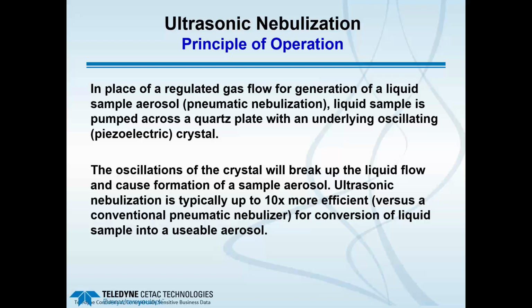We're simply going to use that gas flow to carry the aerosol that's generated by a different process, in this case, the oscillating piezoelectric crystal. Those oscillations will break up the liquid flow and cause the formation of a sample aerosol. This type of nebulization is typically up to about 10 times more efficient versus a conventional gas-based or pneumatic nebulizer for conversion of the liquid sample into a usable aerosol.